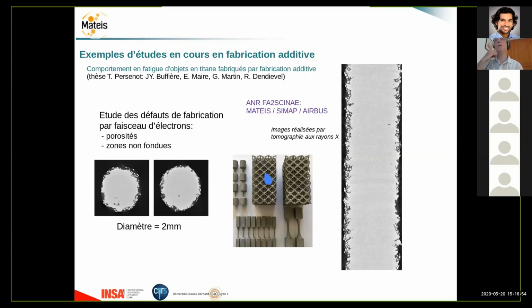It would be better to be able to add some markers here, not connected, in the middle of the void. And I think it's possible if you put a gel which has no mechanical properties, which is full of markers that you will be able to track. I'm sure you will even improve the quality of your correlation.